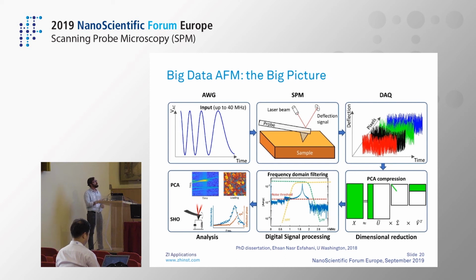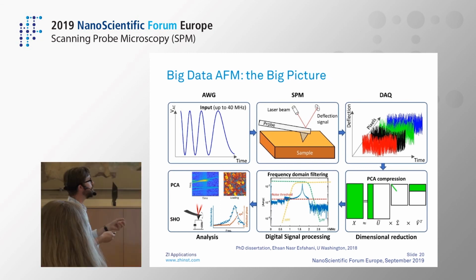So now it's basically not an x-axis, it's a time axis. Of course, you can relate the time to your x component or to your xy component, and then you can trigger this for every line and reconstruct offline. In this case, you will not do an amplitude or phase measurement. You will just stream the data and then apply different filters. Zurich Instruments would help you get up to that point, basically putting the matrix in the right format. So it's already getting there.